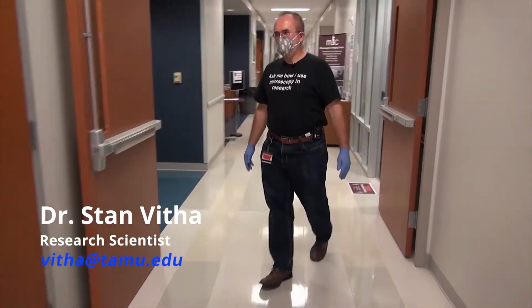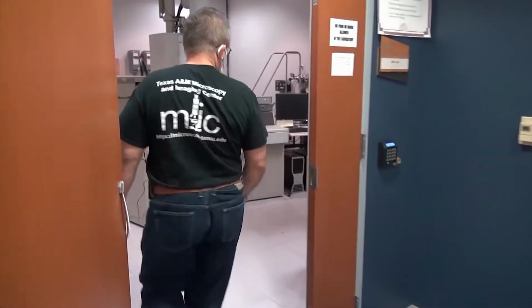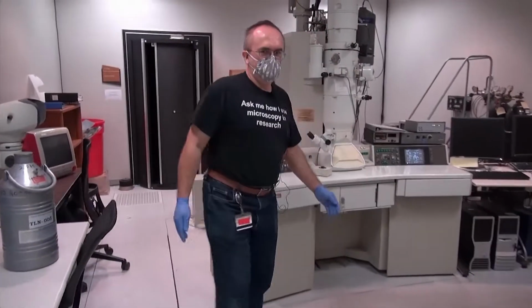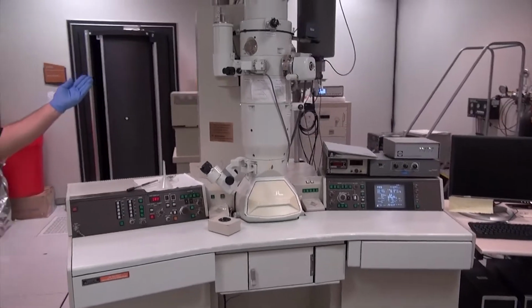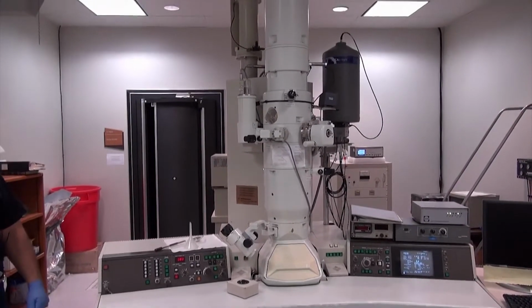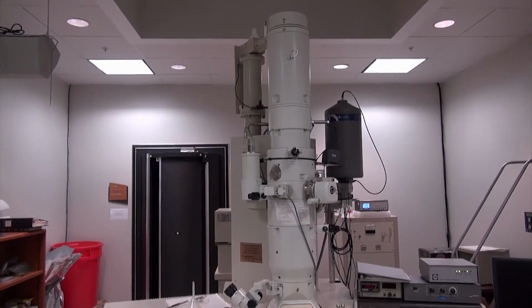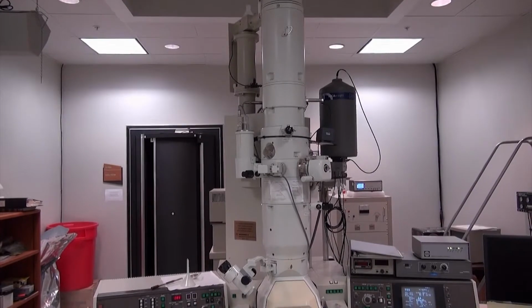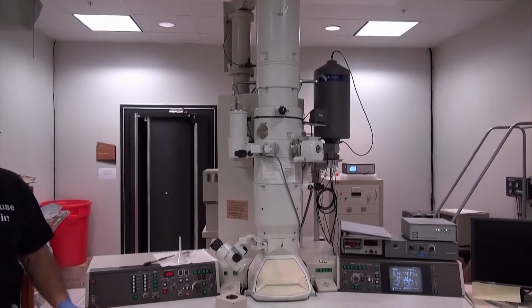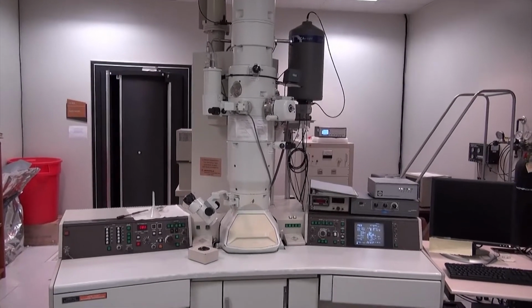Okay, welcome. Our first microscope that I would like to present to you is the JEOL 2010 Transmission Electron Microscope, a 200 kV instrument equipped with a LaB6 filament as an electron source. It has a Gatan CCD camera, an EDS detector, and this is a microscope that is used mostly for materials analysis.